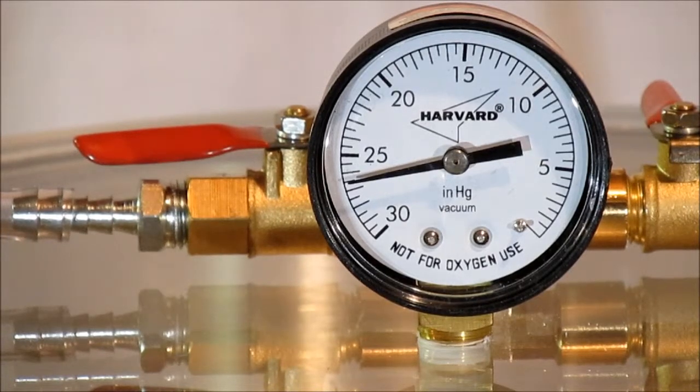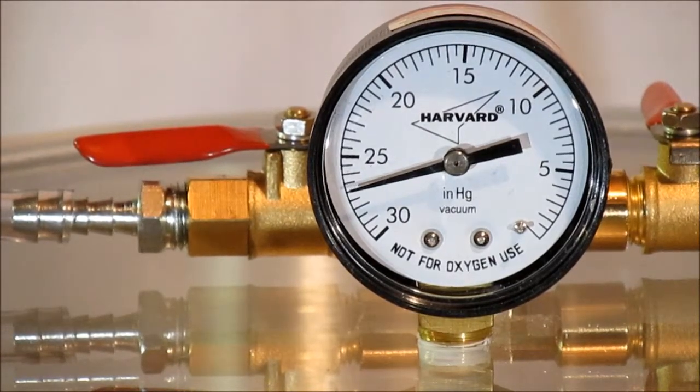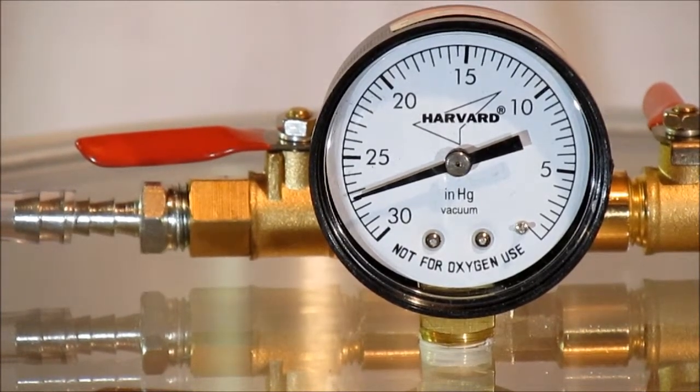For this kit, we're using the 3 CFM single stage vacuum pump that comes with our standard Best Value Vax kits.